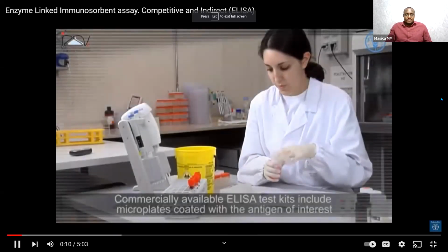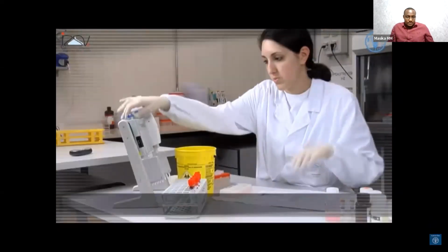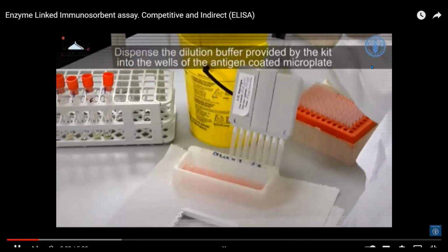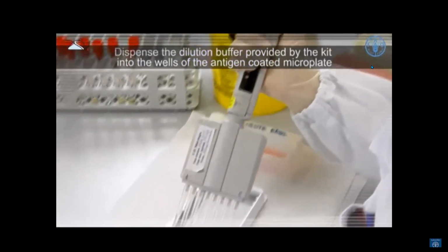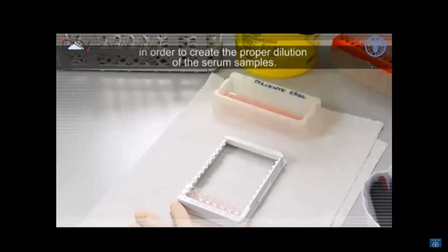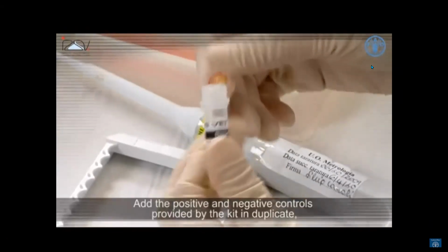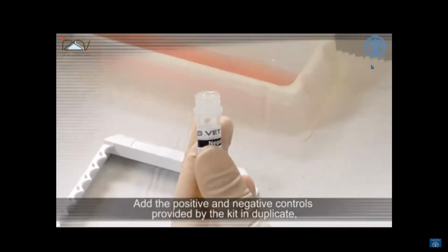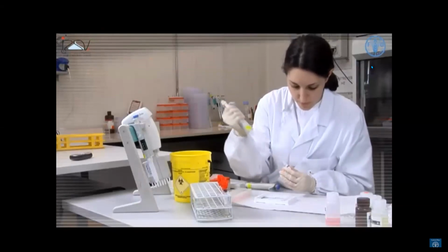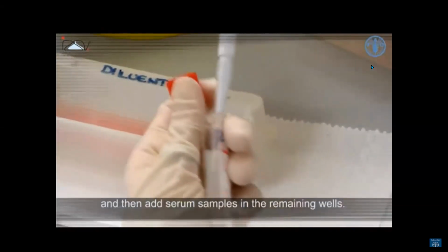Commercially available ELISA test kits include microplates coated with the antigen of interest and all the necessary reagents. The test should be carried out following the manufacturer's instructions. Dispense the dilution buffer provided by the kit into the wells of the antigen-coated microplate in the proportions suggested by the manufacturer in order to create the proper dilution of the serum samples. Add the positive and negative controls provided by the kit in duplicate. And then add serum samples in the remaining wells.